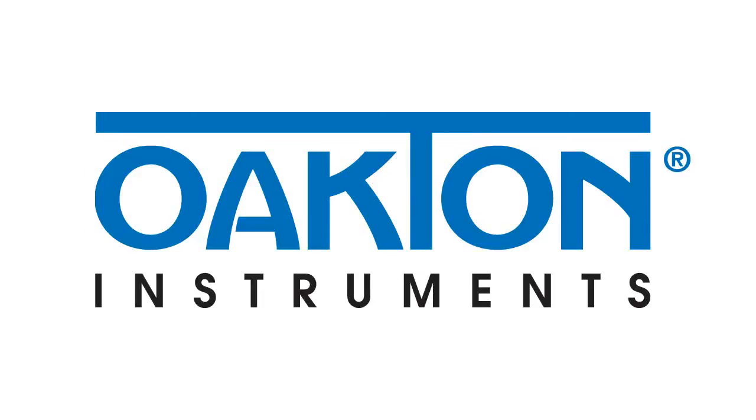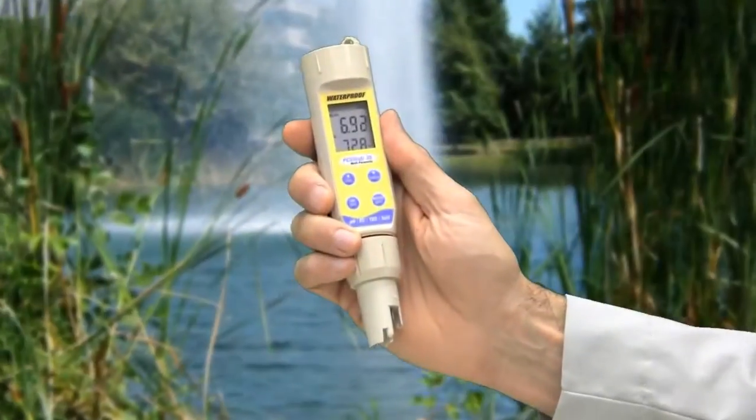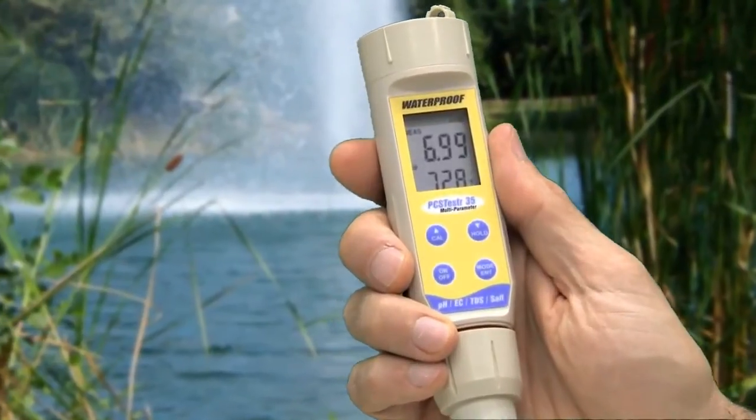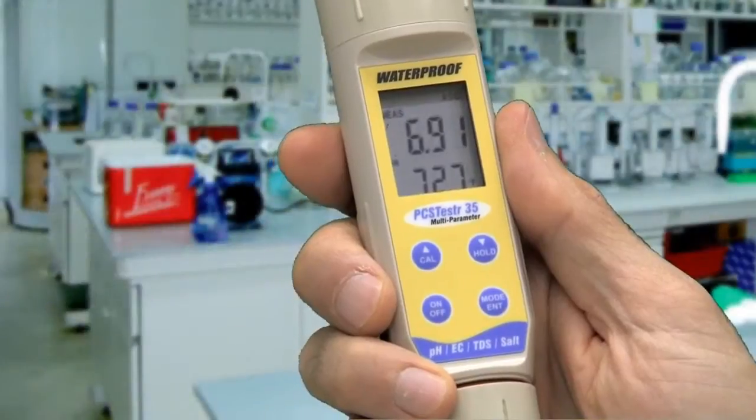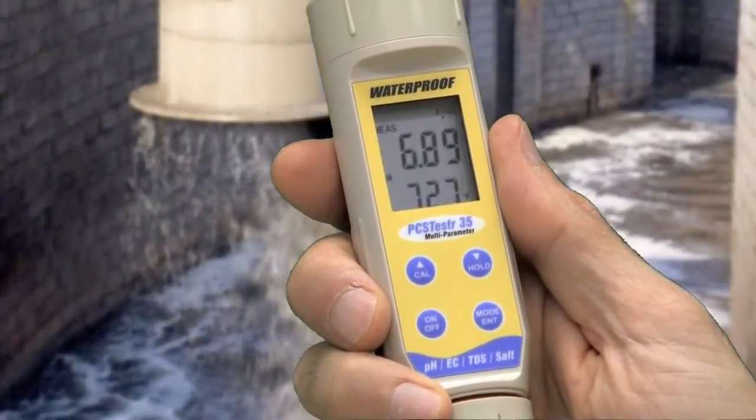Look to Oakden for versatile pocket pH meters, including the Oakden Waterproof Multi-Parameter 35 Series testers, ideal for hydroponics, research, water, and wastewater applications.